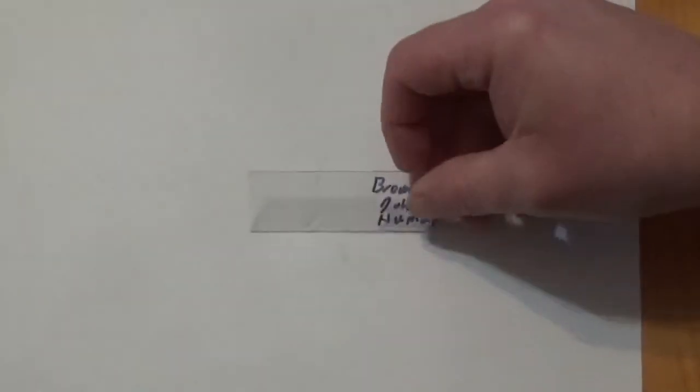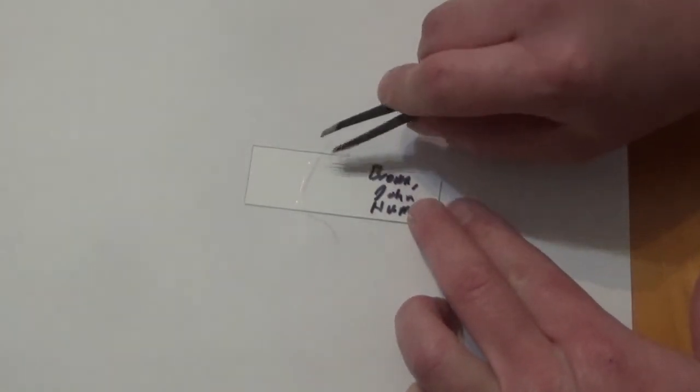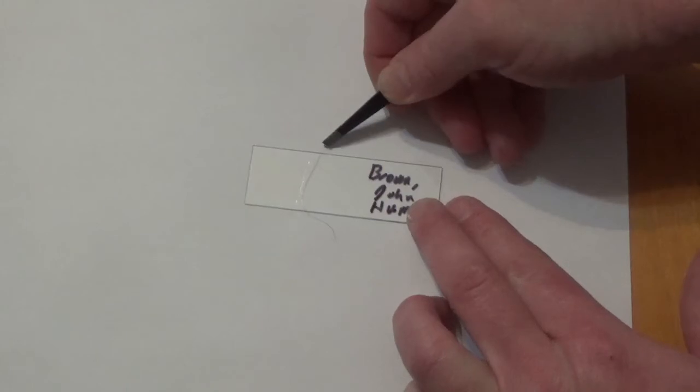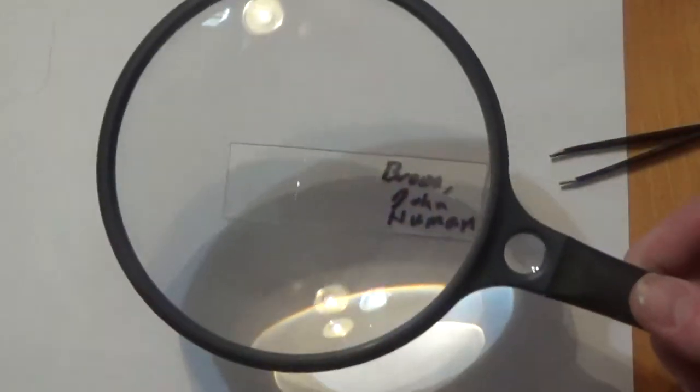Just like on the cooking shows, we have some prepared samples. So here is a sample of my hair, human hair. And you can see the nail polish is dried. So I'm just going to remove that hair. And let's see how well this picks this up. Hopefully you can see that.